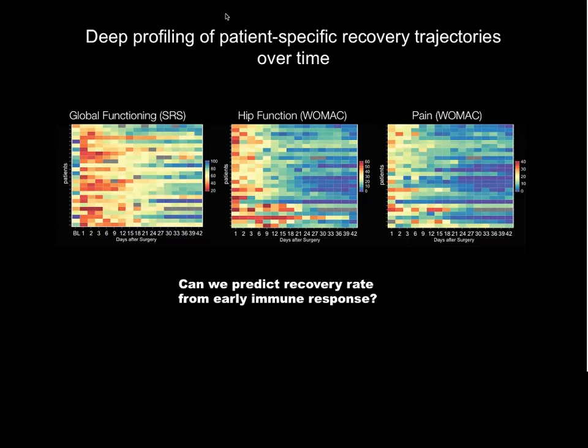So to do this, and actually I want to give the caveat that I'm going to talk about the Citrus analysis that we did, but there's also many other analyses that were useful in this project to really investigate and explore the data, many of which we did using Cytobank, the gating functionality, other sorts of manual exploration of the data, which is very important. But I'm going to sort of zero in on this one part.